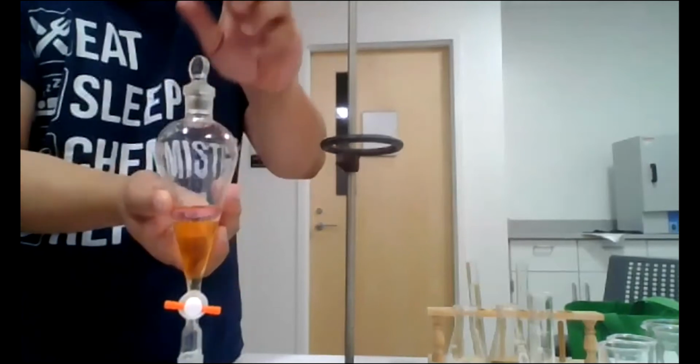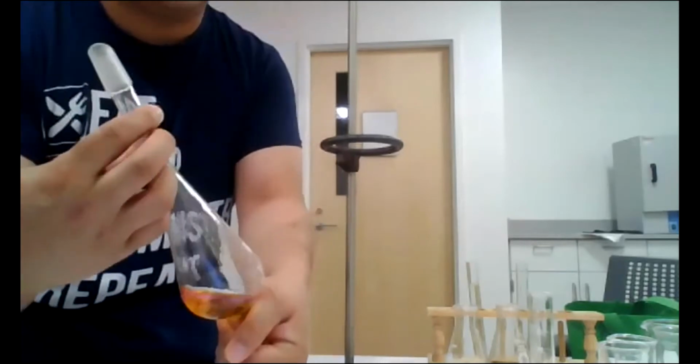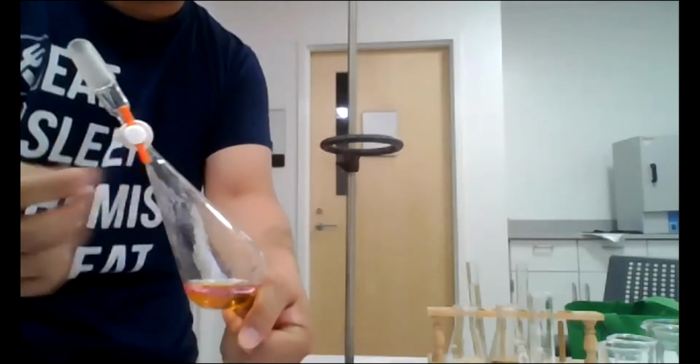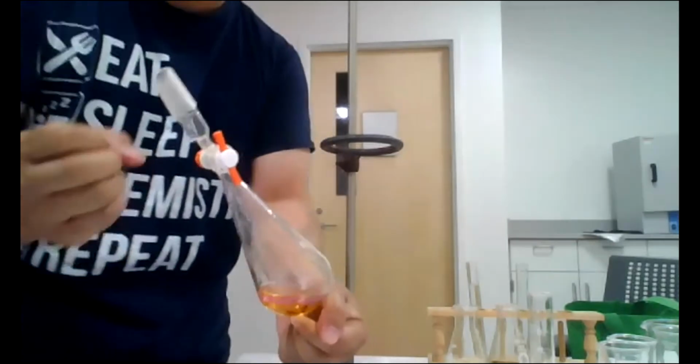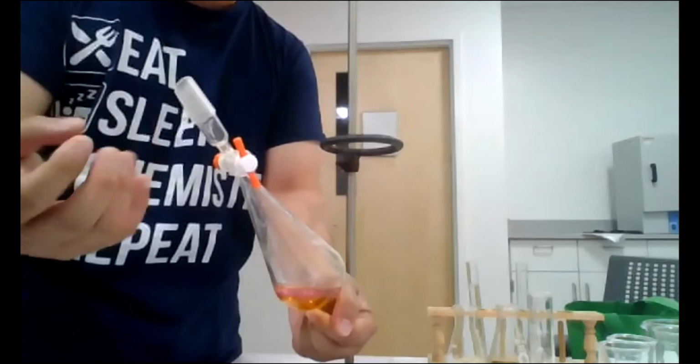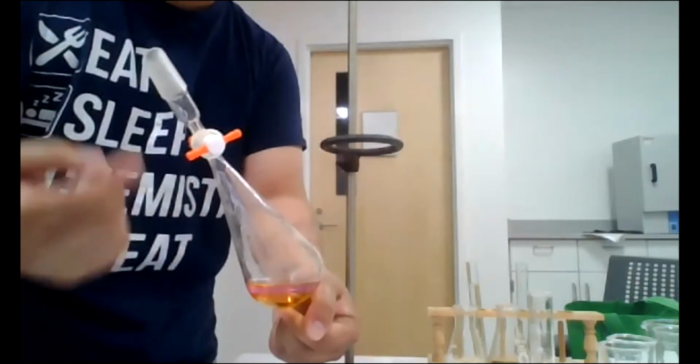The technique is cap it, turn it over, vent it right away. Don't even shake it. Did you hear that? Man, I wish I caught that a little bit better. It went, psst. It released a little bit of gas. So now we're gonna shake, vent, shake, vent, shake, vent.